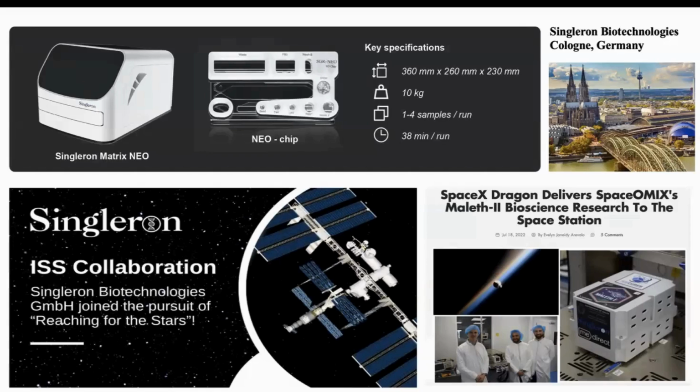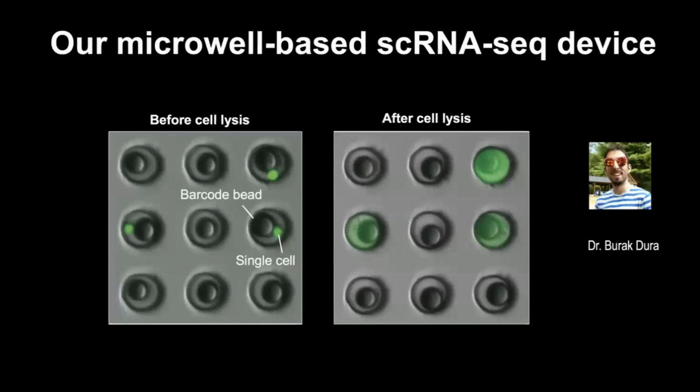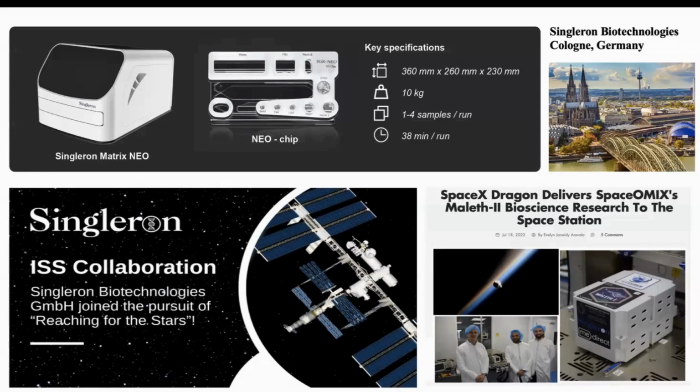Single cell multi-omics still involves a lot of manual work if you do single cell sequencing. For academic research, that's probably okay. But can we fully automate every single step? From this prototype technology to what is now commercially available at Singleron, the major differentiating point is automation, automation, automation. That's always in our minds: how to automate everything from sample collection to a library ready for sequencing. We're getting close to there.